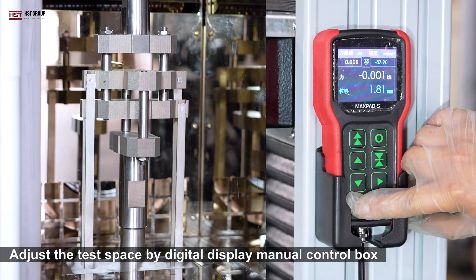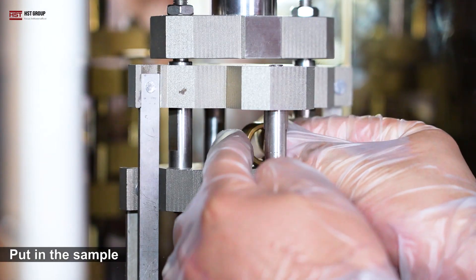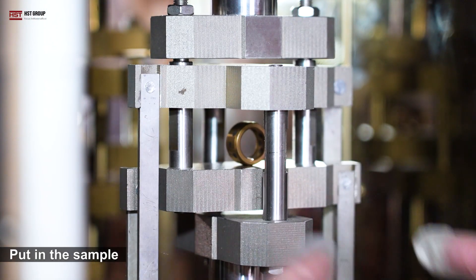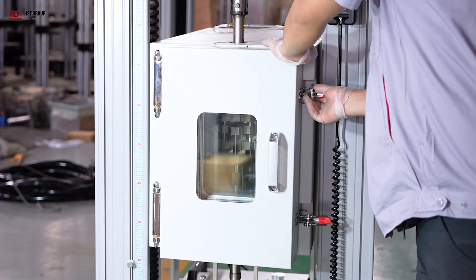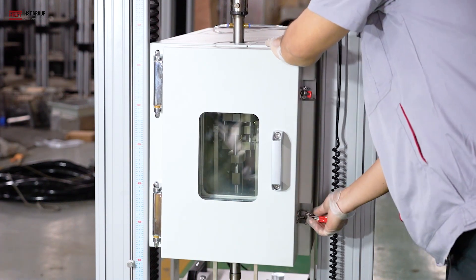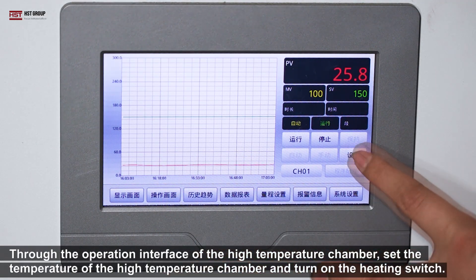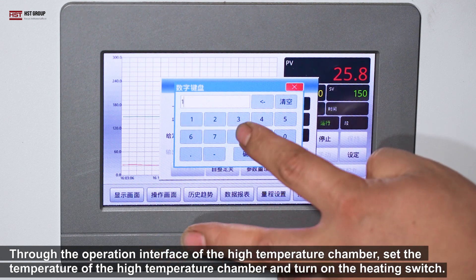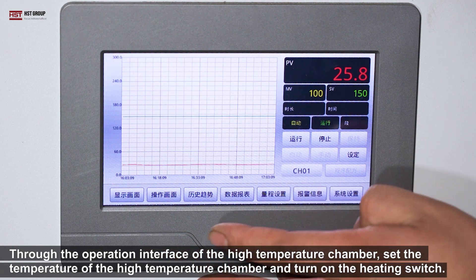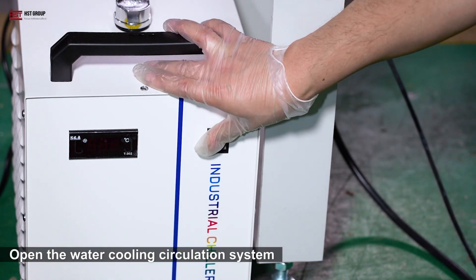Adjust the test space by the digital display manual control box. Put in the sample. Set the temperature of the high temperature chamber and turn on the heating switch. Open the water cooling circulation system.